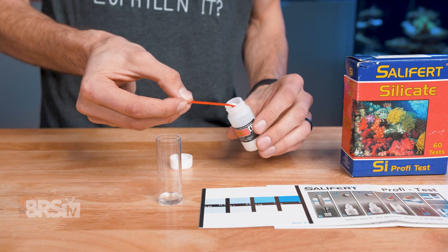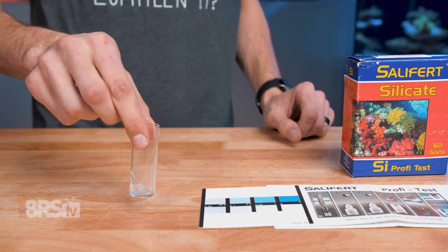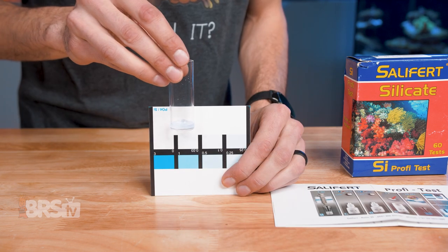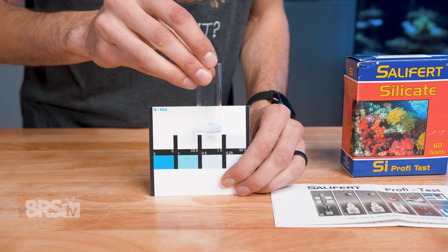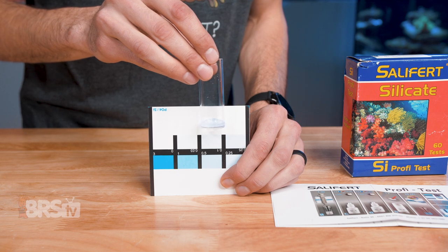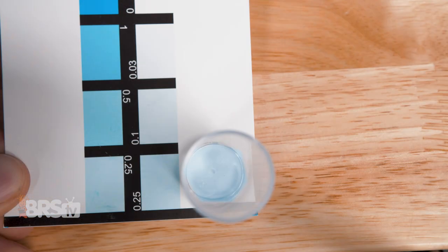Once that timer ends, add one level scoop of SI3 to the vial and then swirl the vial for 20 seconds to dissolve the powder. Finally, compare the vial to the color chart by holding the vial against the white portion of the chart. The color it matches closest to is the reading of silicate in ppm or milligrams per liter. If the reading is higher than three ppm, to get that high range reading, you can lay the color chart flat and place the vial so it is standing on the chart and then look down from above to match the color.